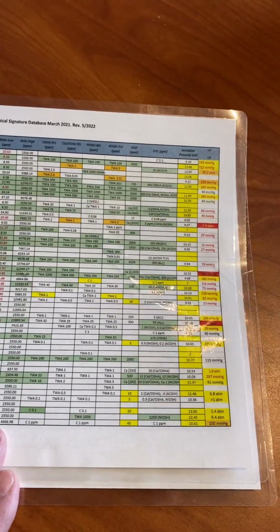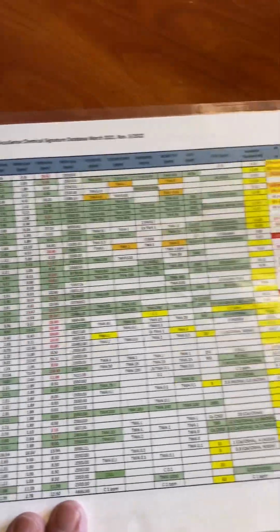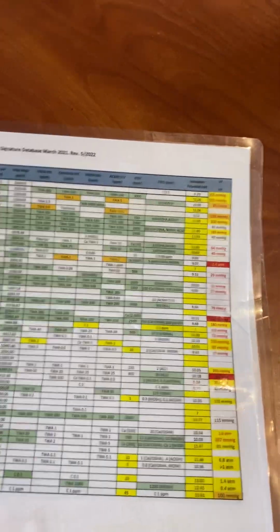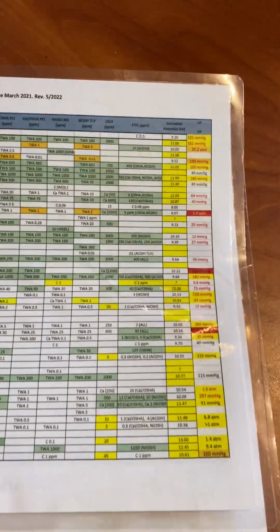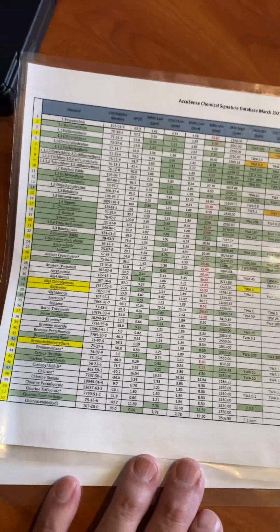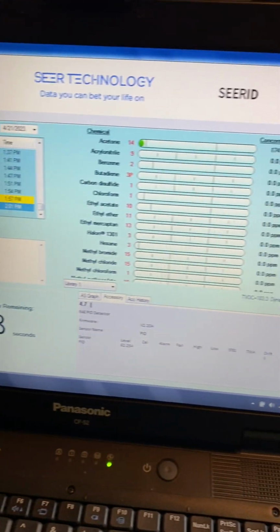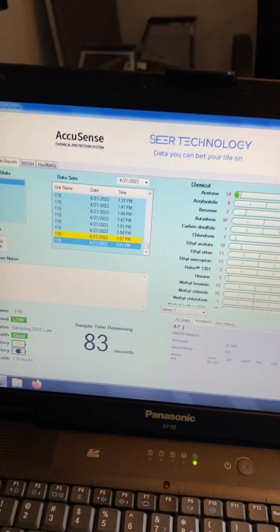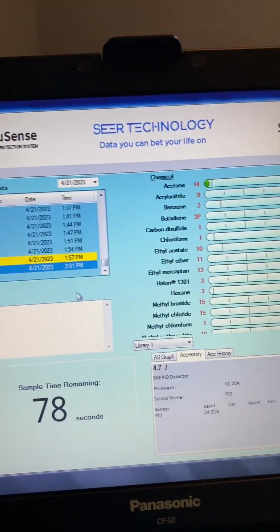In North America, we have temperature ranges all over the place, but pretty much we're not going to get too much beyond 100, 140, 150. So definitely that boiling point range is really good. We can provide you this information. Just give us a call, give us an idea of what kind of chemicals you want on board. The instrument itself can have 25 chemicals in its library, customized to whatever you want, plus 3 more libraries of 25. So we can have up to 100 chemicals on your instrument. And that would then give you a good indication of what's in the field.